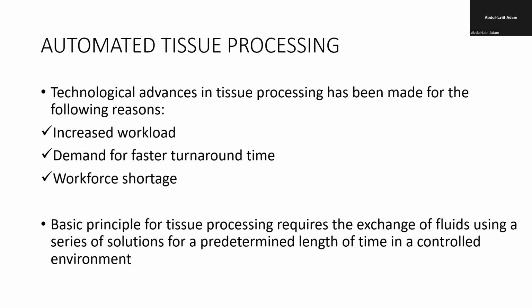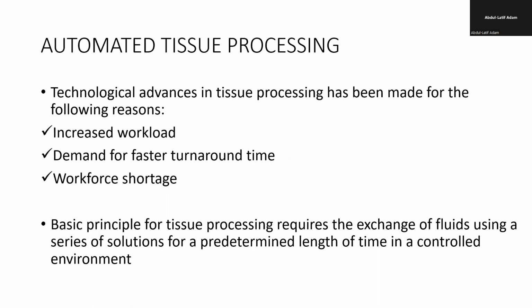Okay, so you can delay the time to start on Sunday depending on your schedule. So if you have an 18-hour schedule or 20-hour schedule or 16-hour schedule, you schedule it and let it delay, so that it will process well by the time you get in the morning.